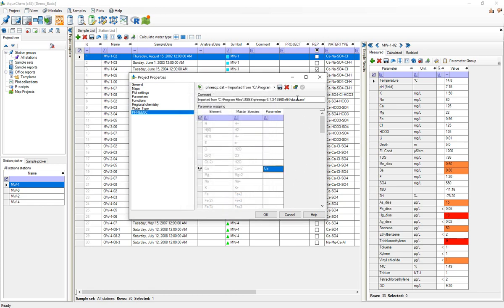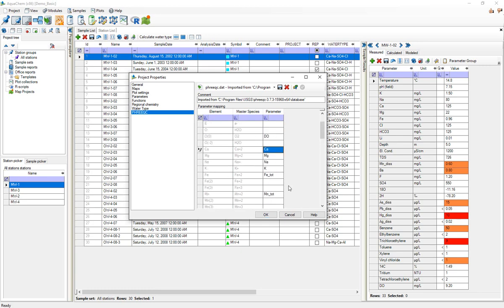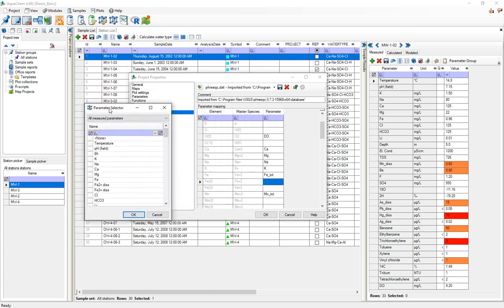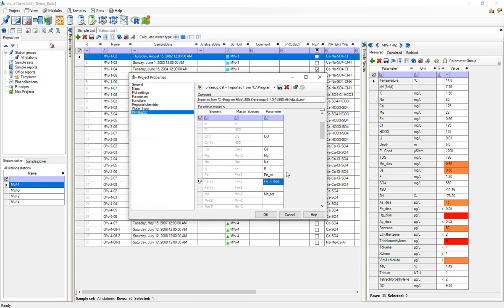Or optionally another thing I could do, and probably a good first step, is to press this auto map parameters. By doing that AquaChem will attempt to automatically map these parameters. As always it's a good idea to take a look at these auto mappings and just verify that they're done correctly and they're also comprehensive. So for example here iron 2, it was not actually associated with iron 2 in this database even though we've got data for it, so I'll just select Fe2+ and now that's been associated.